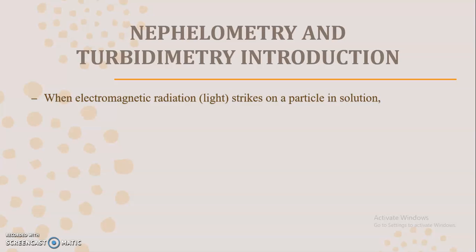When the electromagnetic radiation, or light, or energy strikes the particles present in the solution. The spectroscopy techniques we have studied, like UV spectroscopy, visible spectroscopy and atomic absorption spectroscopy, are applied to homogeneous solutions where the solute molecules are present in the dissolved form.